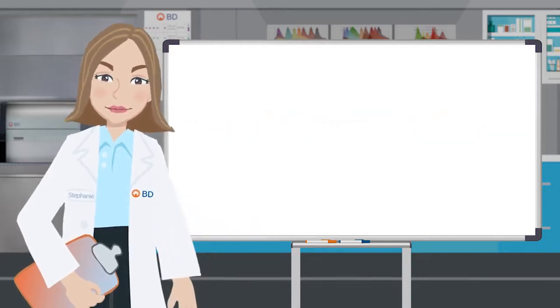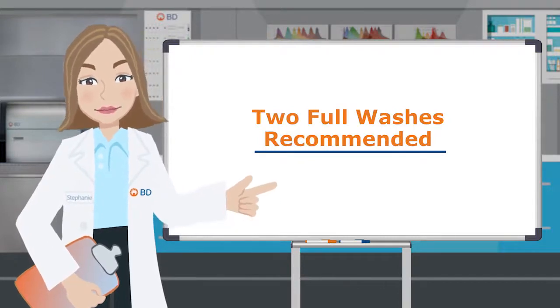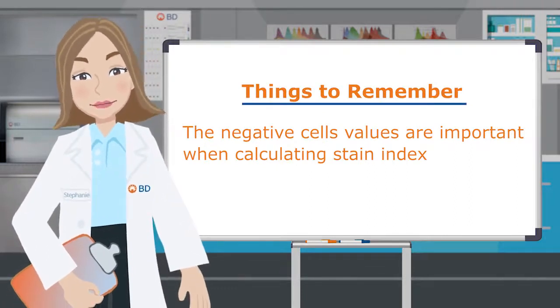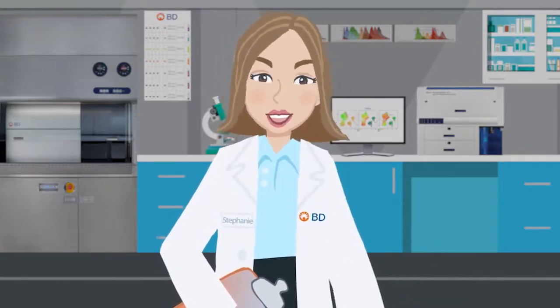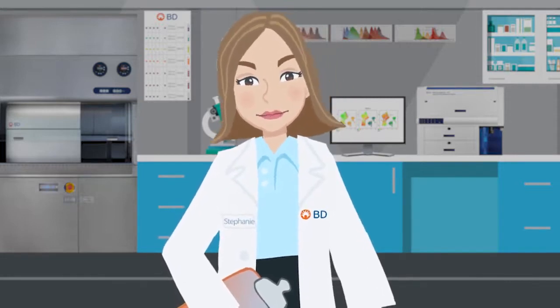For whole blood staining, it's recommended to do at least 2 full washes after lysing buffer has been removed. Here you can see the calculated increase in stain index with each additional wash. Typically, this kind of increase is from tightening up of the negative cells and decreasing the negative MFI. Remember, the negative cell values are important when calculating stain index. Of course, there may be times additional washes are not possible, such as when you have extremely low cell counts. But if you have enough happy, viable cells, the additional wash may increase your marker's resolution.